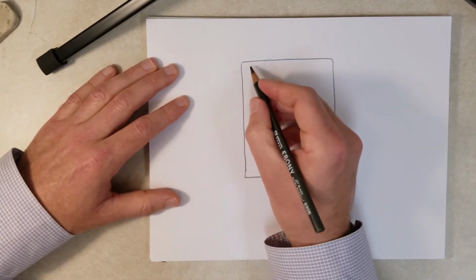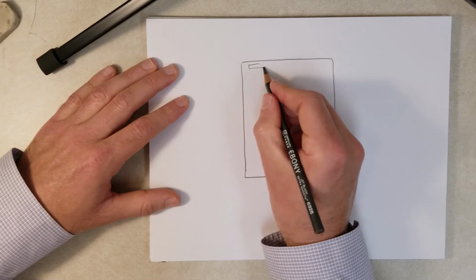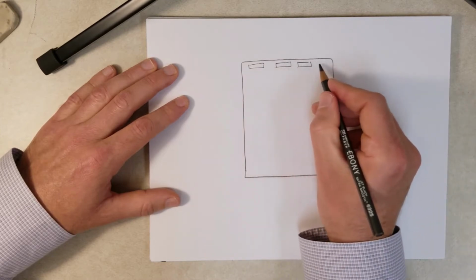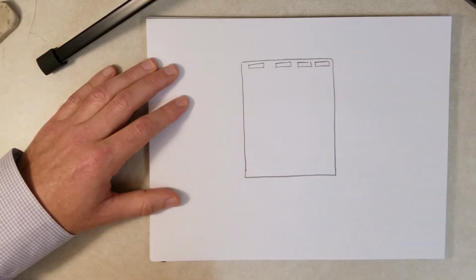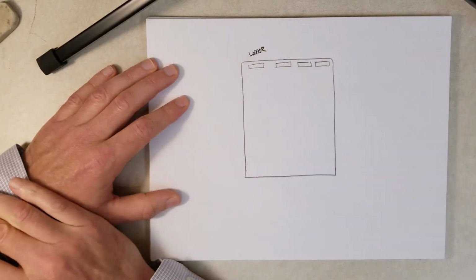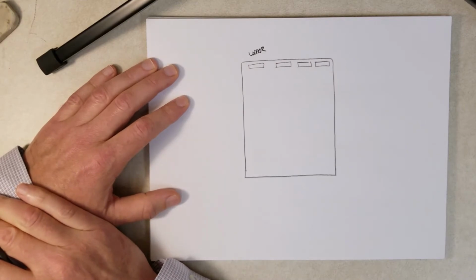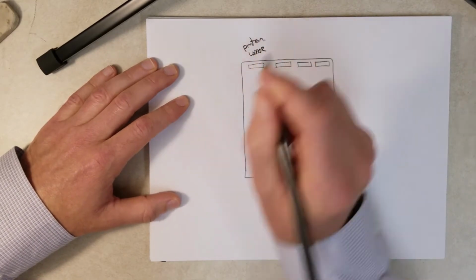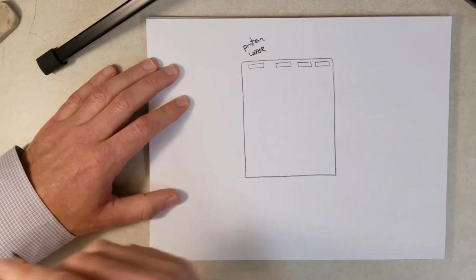You apply an electric current, you have wells where you load the proteins into. Usually you have a ladder, just like a DNA ladder contains molecules of known lengths. A protein ladder is going to contain proteins of known molecular weights.